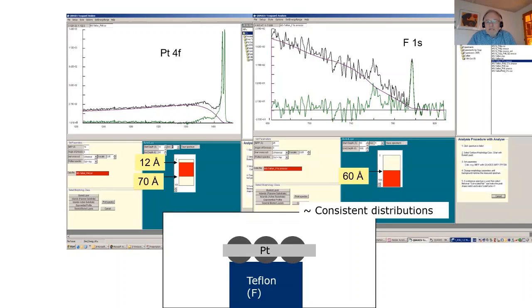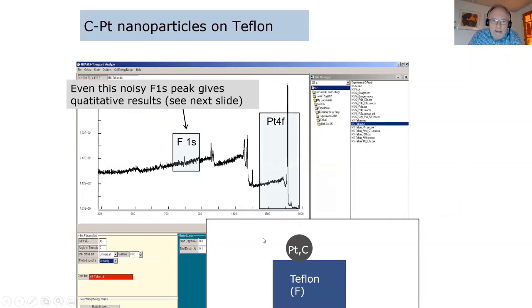similar. So what I want to show with this analysis is that even if you have very, very small peaks, you should still try to analyze them. You can usually get a lot of useful information. A low intensity is less of a problem than the problems you have if you have interfering peaks. You should really worry about that.